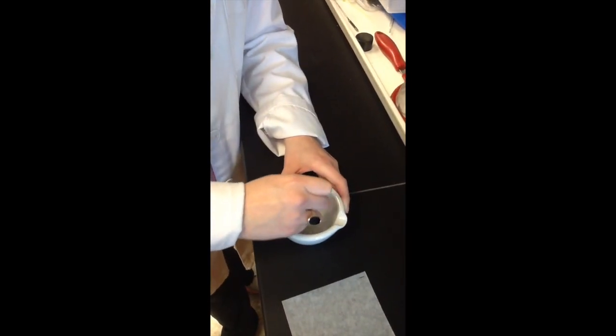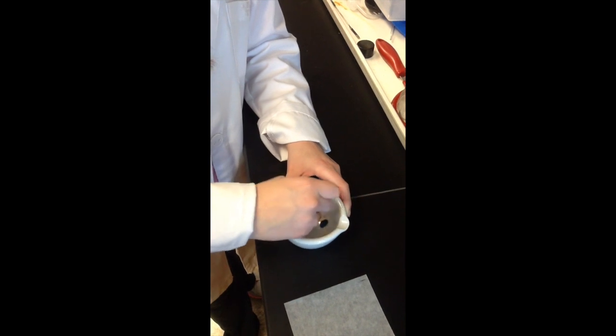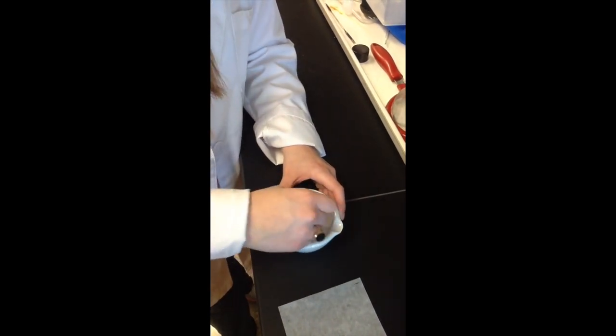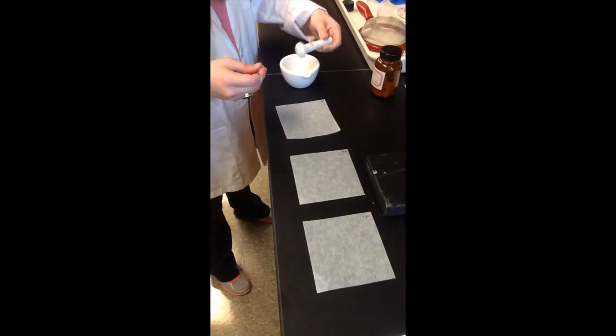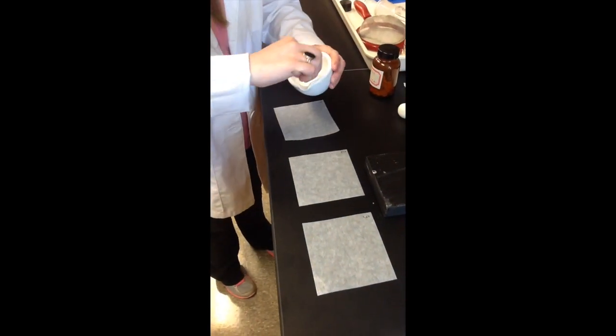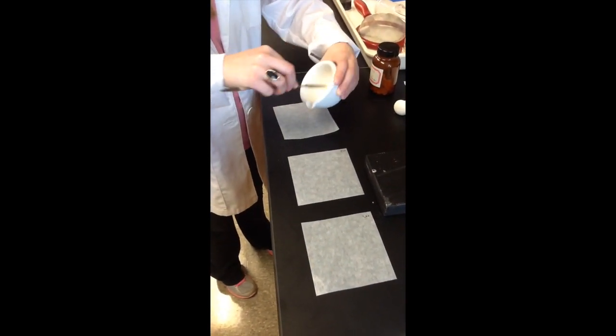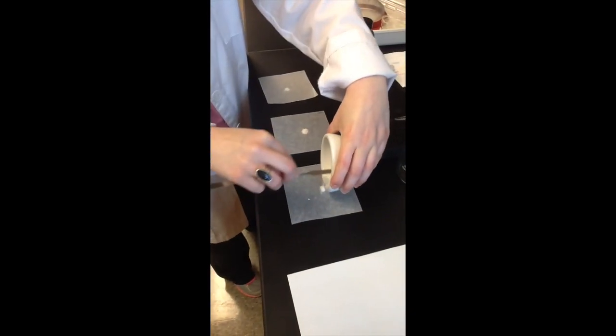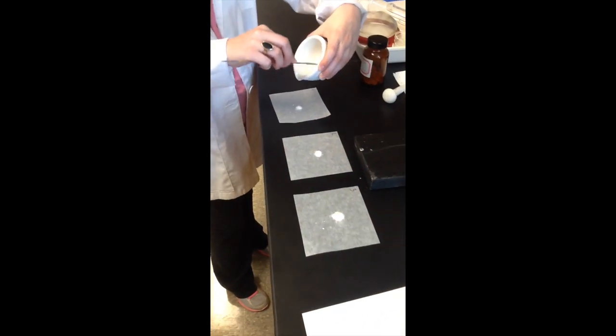Using the mortar and pestle, crush up the tablet into a fine powder. Then divide the crushed tablet between the three weigh papers. You will perform three titrations with these three samples. Once you have divided the crushed tablet between the papers, weigh the paper and crushed tablet to determine the mass of the crushed tablet.